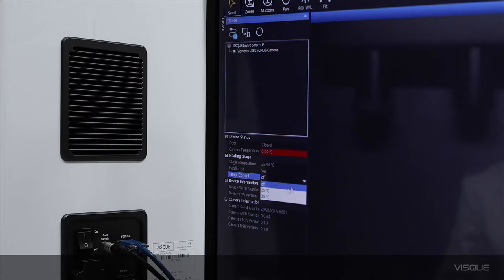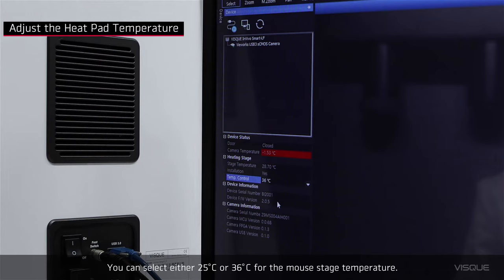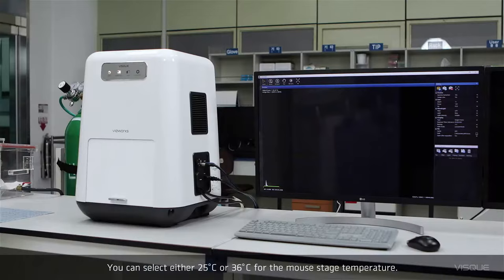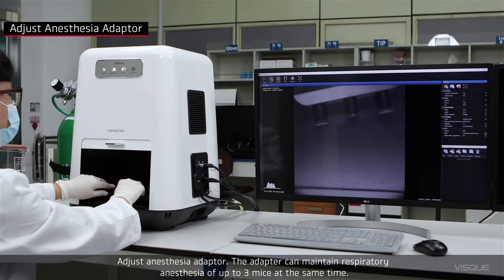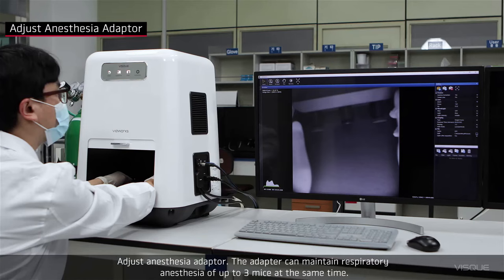You can select either 25 or 36 degrees Celsius for the mouse stage temperature. Adjust an anesthesia adapter. The adapter can maintain respiratory anesthesia of up to 3 mice at the same time.